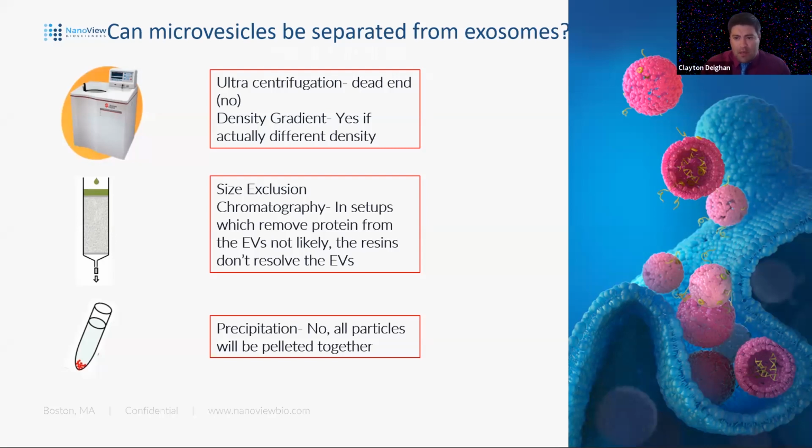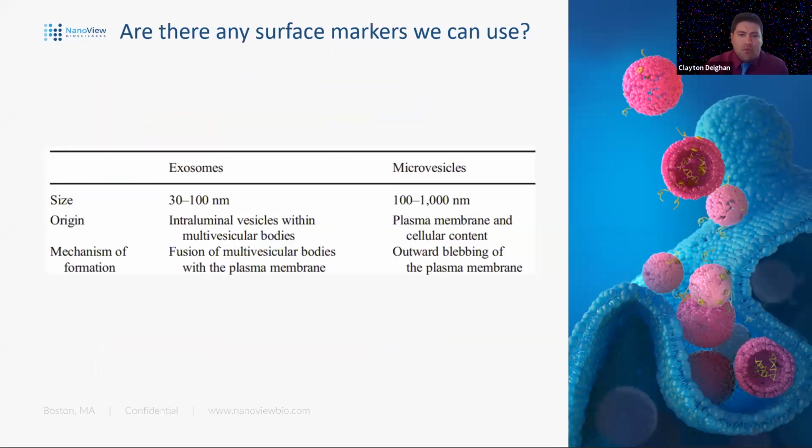And I think everyone understands now what we have is a collection of extracellular vesicles that we need to be able to analyze to determine which are the important ones we want, or what the difference between the different subpopulations is. And the assumption that they are homogeneous in their nature is one that we're going to show in the rest of this presentation is not really a very safe assumption anymore. So it would be useful if there were known surface markers whereby we could pull down one class of these vesicles or get another one alone. The most common markers that we read about, though, are things like the tetraspanins, and differential expression of distinct protein markers between exosomes and microvesicles isn't really noted in their comparisons.